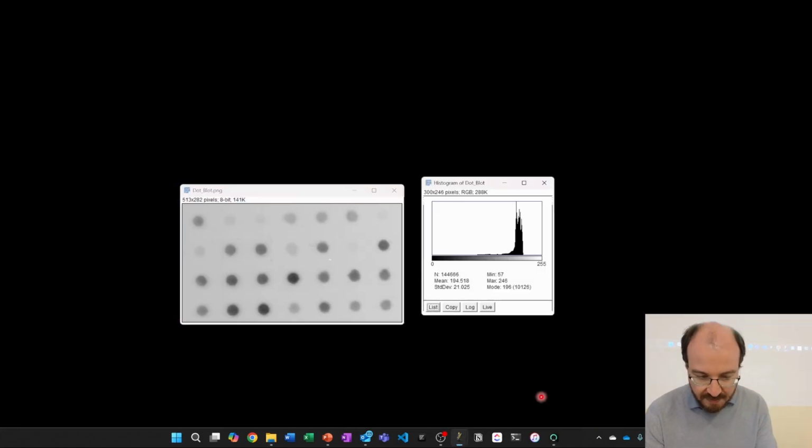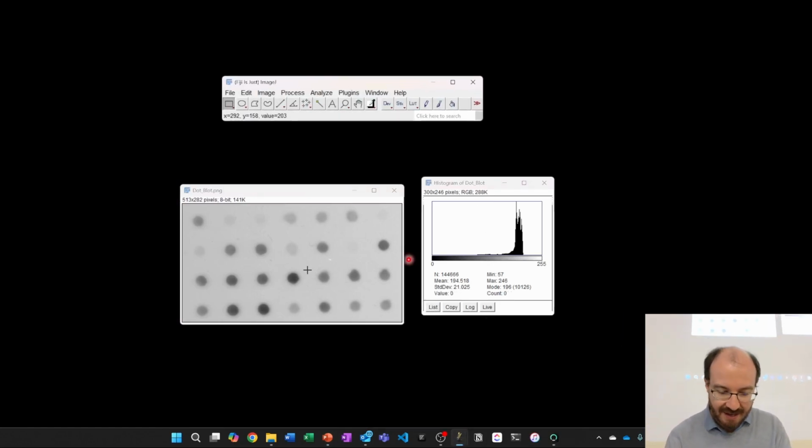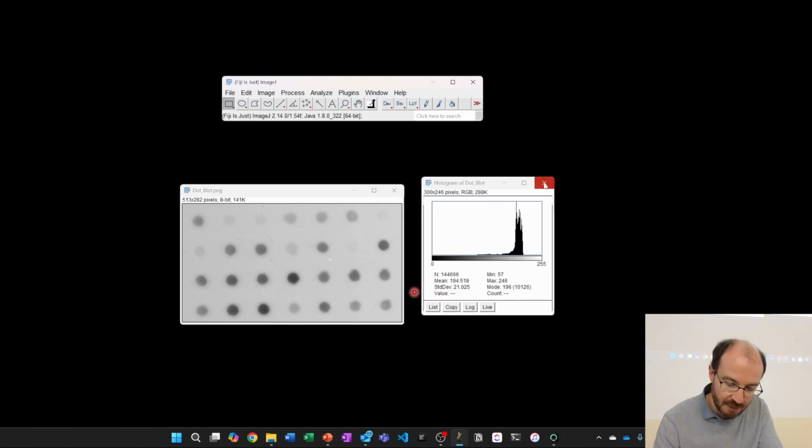All right, so if you've got your image now, and you see the histogram, I want to demonstrate that with your eye you can see that there are low intensities. Maybe not all the way to 0, but they are fairly dark parts of the image. But if you look at the histogram, it seems like there isn't really anything going on there. And the peak is clearly towards the brighter intensities, the high gray level values. If you just think about it logically, why is that? It's because the majority of the background is of this brighter intensity, and that's why the majority of the voxels are there. But because there are so many of them there, you lose the information, or the resolution in the histogram, at this lower end.